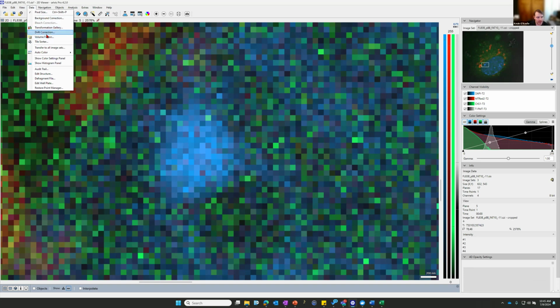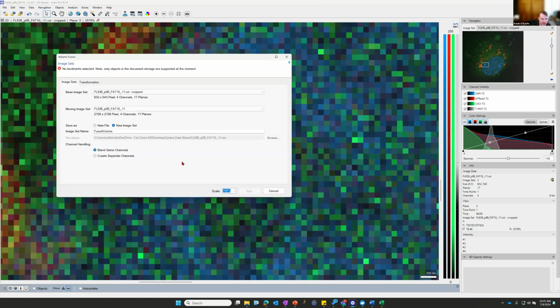We also have some other options. Drift correction, if you have some drift happening across channels, you can manually adjust those. We also have this volume fusion. Let's say you have two different, let me think.